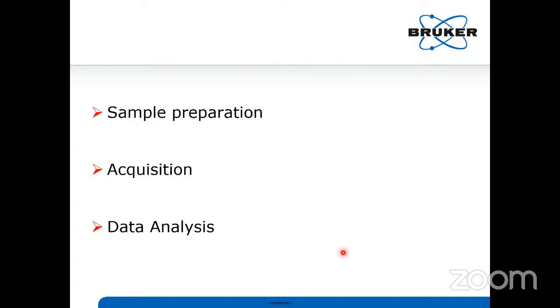Next is the acquisition part. Once you have a very good sample, yes, I prepared a nice sample. I did the protein digestion. I got very good peptides, a number of peptides here. I just want to confirm my protein sequence now. I have a very good sample. I filtered properly. Everything is done.